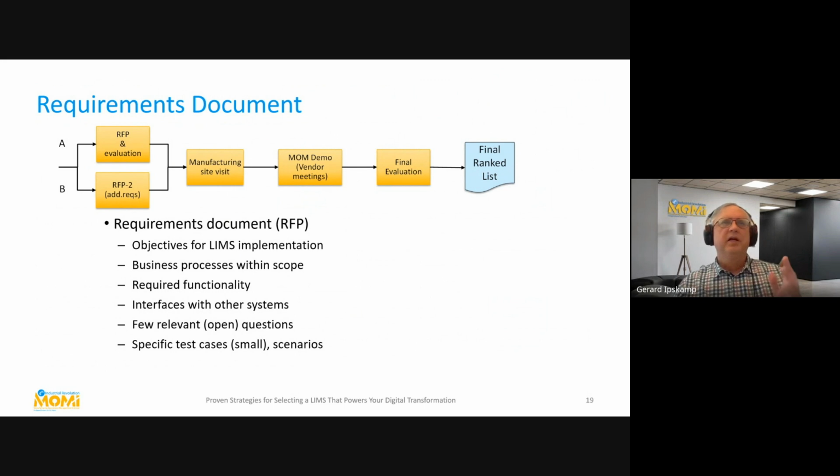Requirement document. One of my statements there is always make sure that you realize that the vendor doesn't know you. So don't send them just an Excel with requirements, because he has no clue what you are asking, and he will probably say yes to everything, just to be sure that he's invited for whatever next step there is. So what I try to do is write an RFP with objectives for a LIMS implementation, with at least high-level process descriptions, how it goes, what is important. Then, of course, the functionalities and the other requirements.